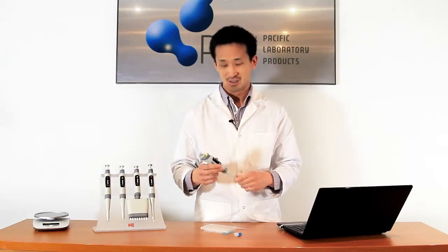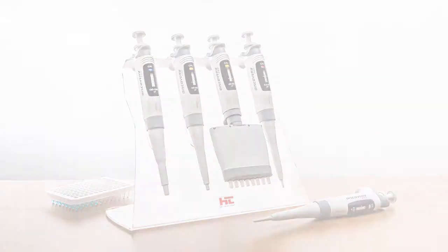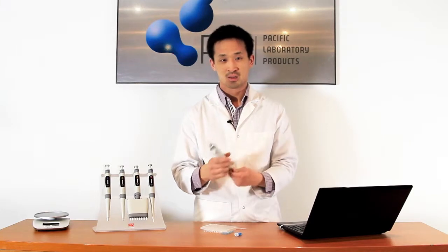Thanks for tuning in to PLP TV. We're looking at the HTL Pipettes today — one of the lightest units on the market, with a really good action.